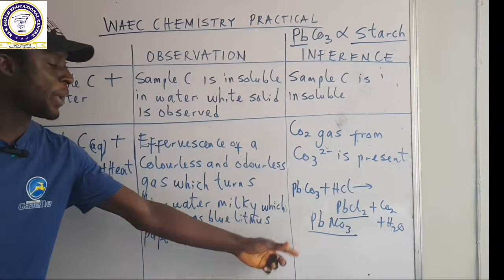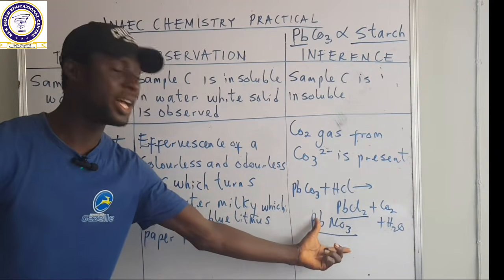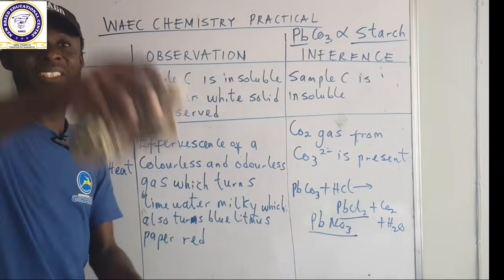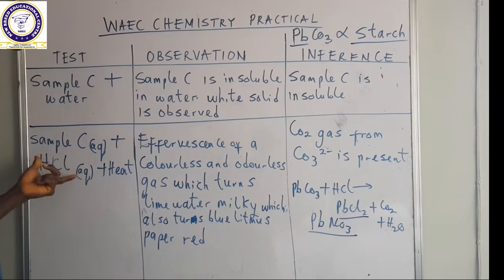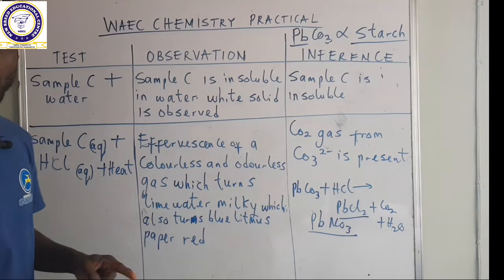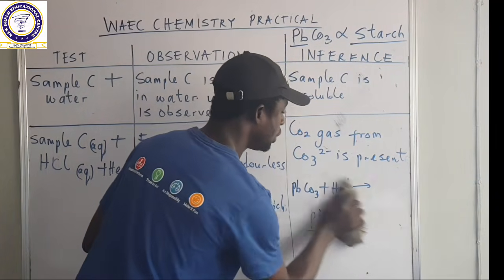So at this point, we don't need to heat this one. Do you understand? Because this one already becomes soluble, it becomes our filtrate when we filter, and our starch becomes our residue. Are you getting that? Alright, so you note if it's HCl or HNO3 they are asking you to add. So that is the clarity between the two.